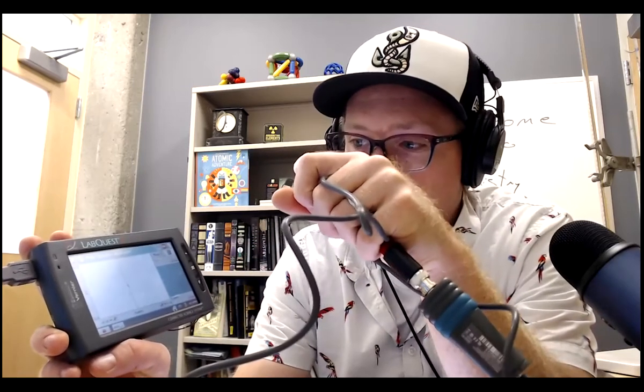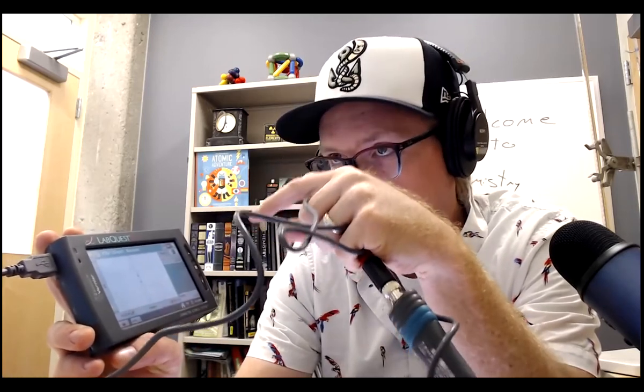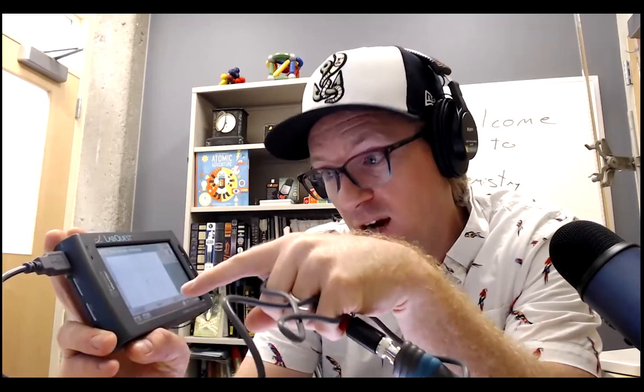You add a little bit of cerium. You'd wait for it to stabilize a little bit. Don't wait minutes and minutes and minutes. Don't wait for the last sig fig to stabilize, because that's where the error is. Then you hit keep. You add a little bit more, wait for it to stabilize, hit keep, and so on and so forth. So that's a little bit on the LabQuest.